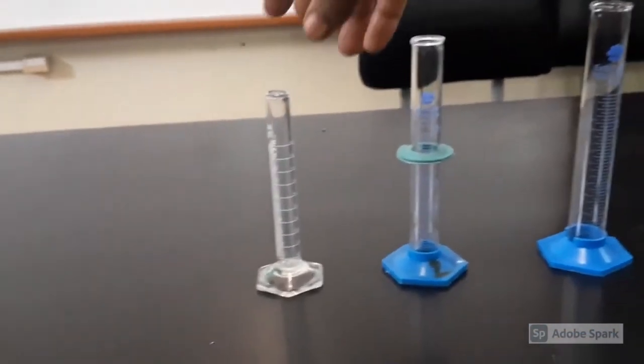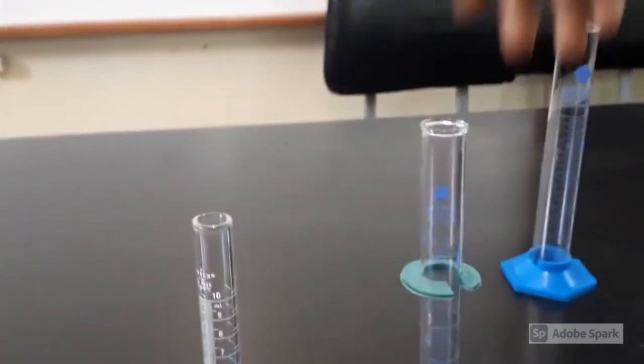Volumetric equipment are those equipment that you can use for measuring, while non-volumetric are those ones you can just use for holding. Even though they have calibration, they cannot be used for measuring. Examples of volumetric, we have the measuring cylinder. This is a size 10 mil, this is 25, and this is 50.